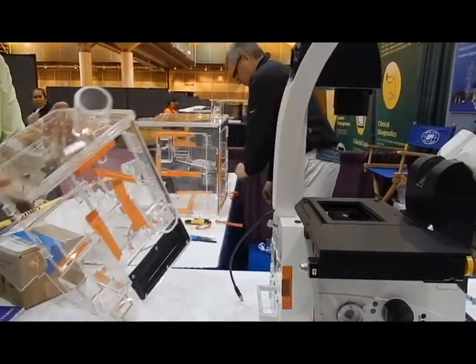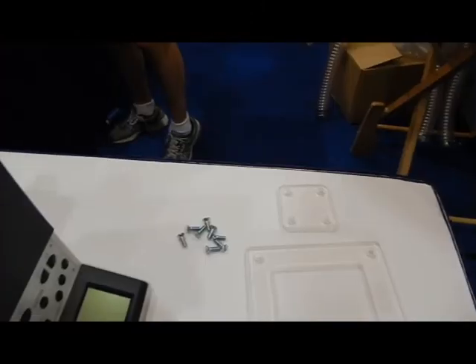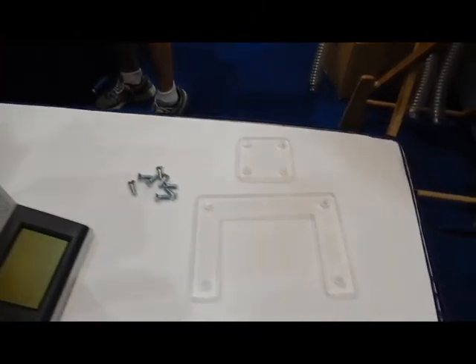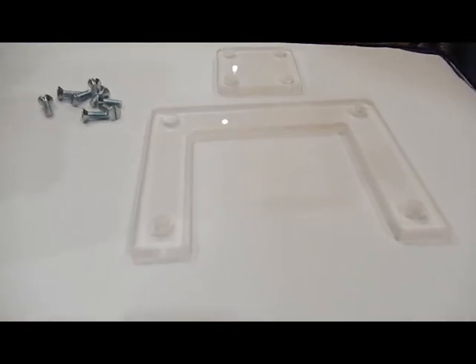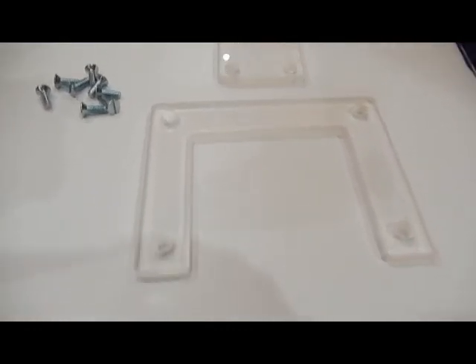The microscope enclosure comes in two halves. The connector plates and screws, which are taped to the bottom of one of the chamber halves, are used to join the two sides of the enclosure.